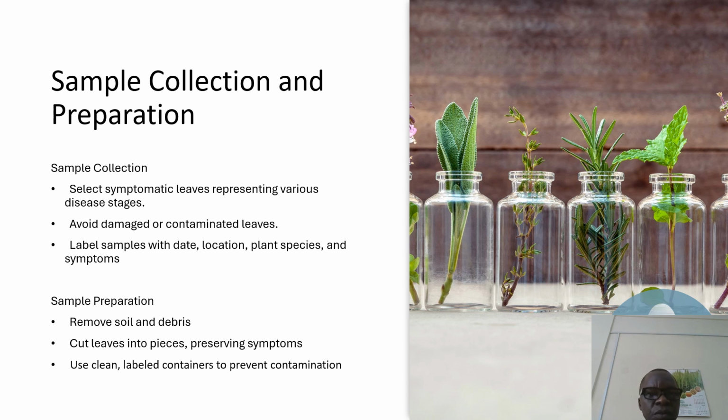In collecting samples, you need to select symptomatic leaves representing various stages. You also need to avoid damaged or contaminated leaves. Of course, you have to label them appropriately based on date, plant species, and location.